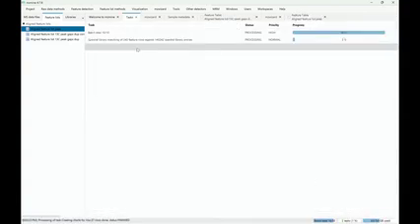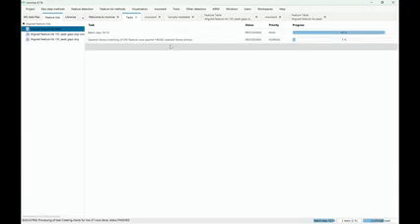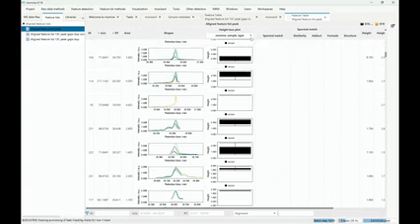And it's doing the spectral library matching, and spectral library matching against the GC libraries is a little bit slower because there's no precursor ion information, so it's a bit harder to filter down and to prioritize. But still, once you do this, you're going to see the same results, and you're going to have the same kind of feature table and kind of feel in mzmine that you have for your data analysis.